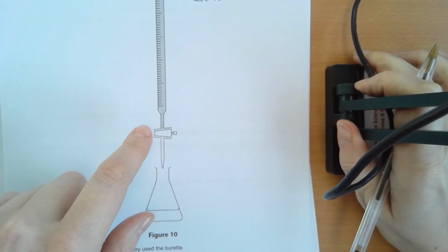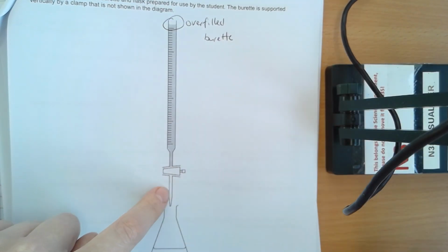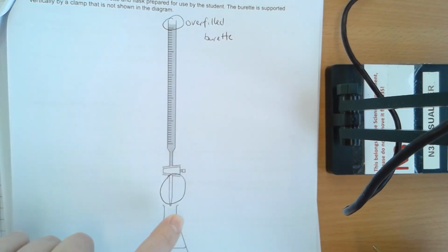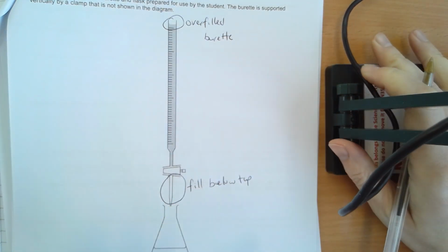Second thing they've done wrong is they haven't filled below the tap. When you're filling the burette, the tap is initially supposed to be open, so this part fills and then you close the tap again. It's calibrated so that this part has to be filled, so you have to fill below the tap. And you needed to spot those 2 mistakes.